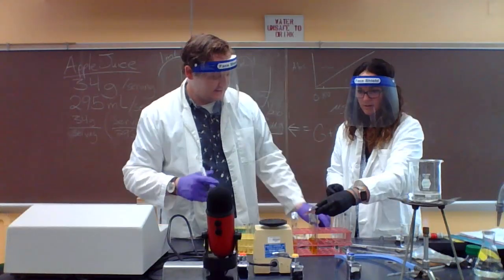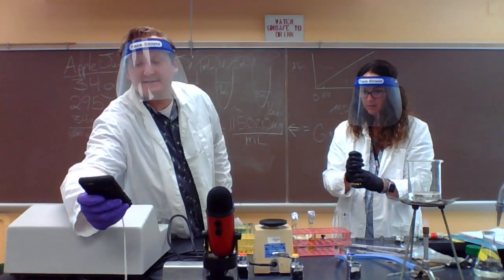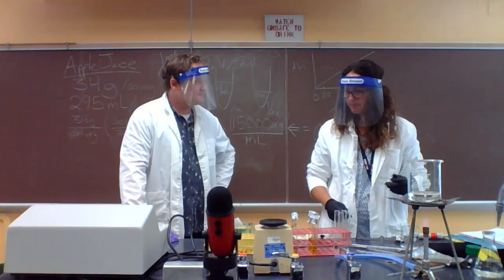So wait until it starts boiling a little. Great. Okay. Cool.